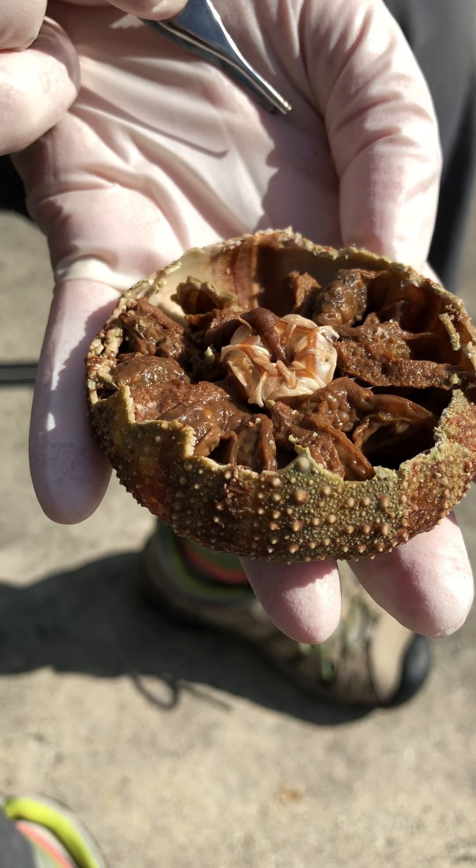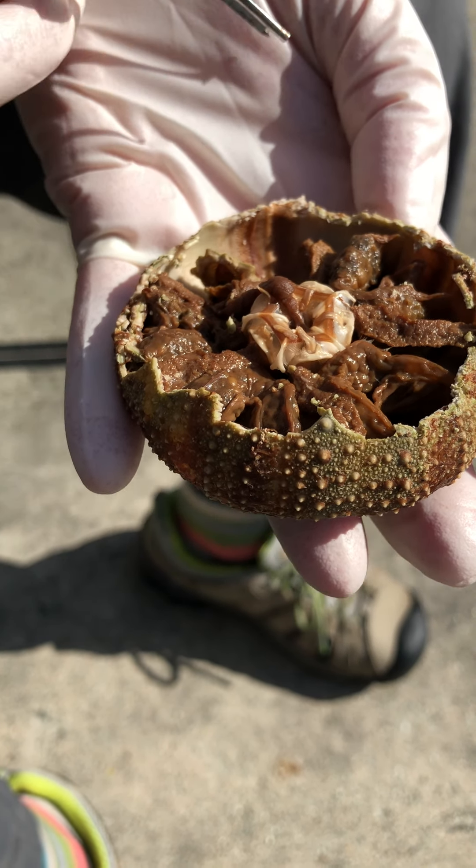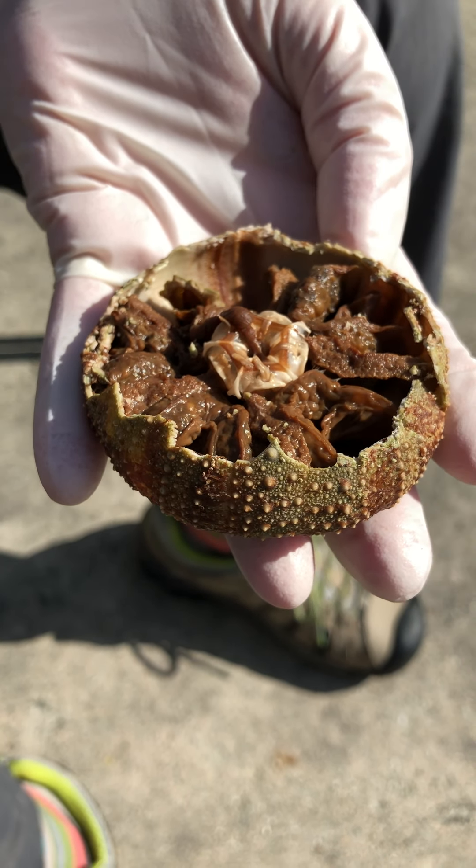I think we have the internal anatomy of the sea urchin covered. Well done.